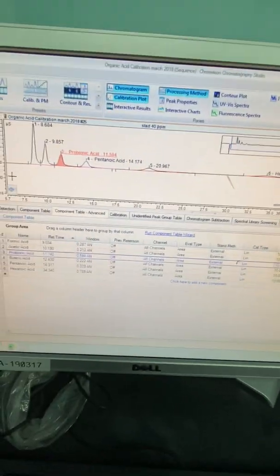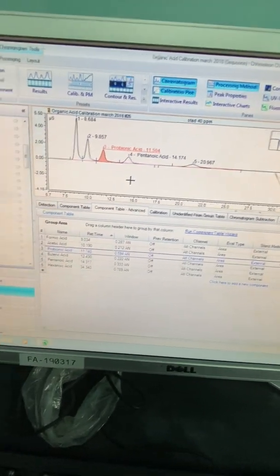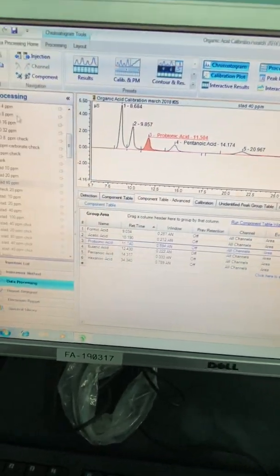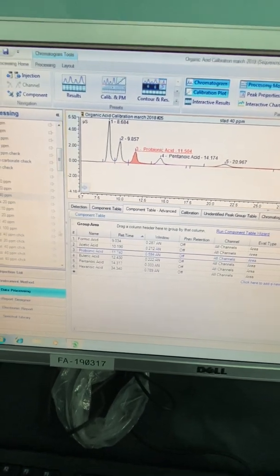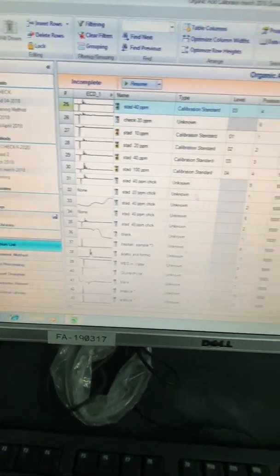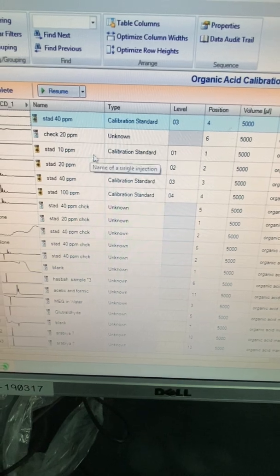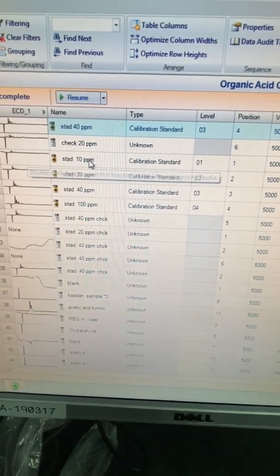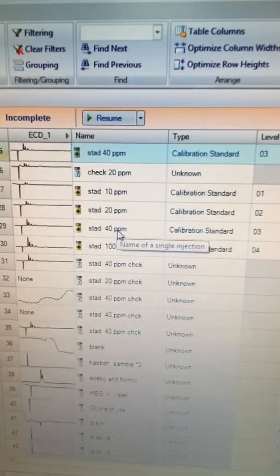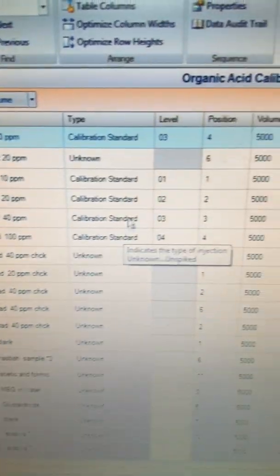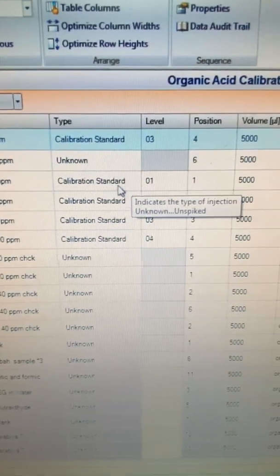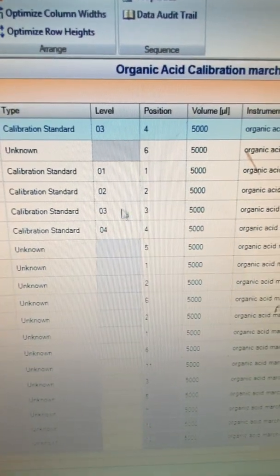The calibration is easy. You have just to make your own process method. Go to the injection list. Select which run you want it to be calibration. Like here, we have 10, 20, 40 and 100 ppm. Each one selected as calibration. And which level.